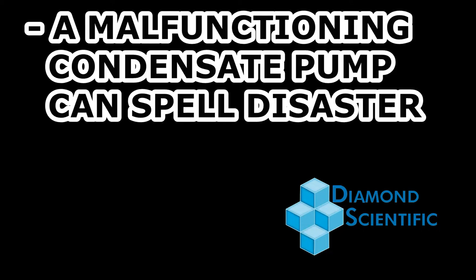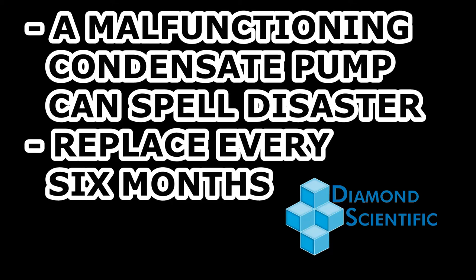The condensate pump tube is instrumental in removing moisture traveling through the gas line from the device and keeping it from damaging the internal components of the SWG 100. You'll want to replace the condensate pump tube once every six months or twice a year.